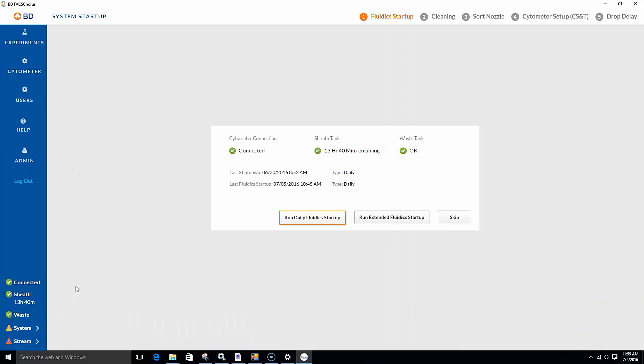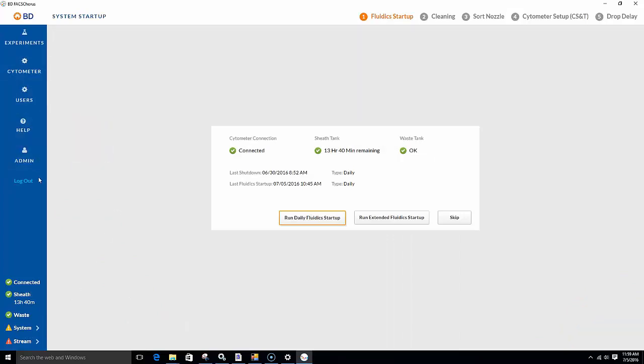The opening screen includes a navigation bar on the left with a list of tasks. There are numbered tabs across the top that serve as a guided workflow. System status information is displayed at the bottom of the navigation bar.